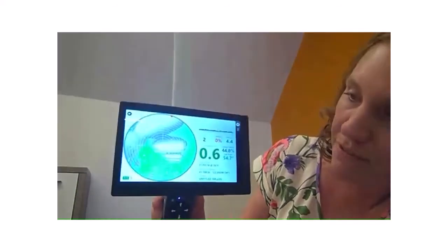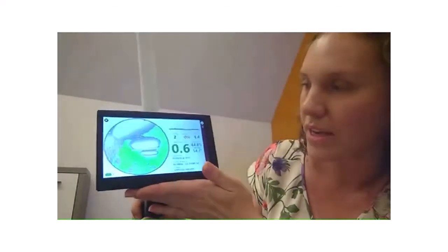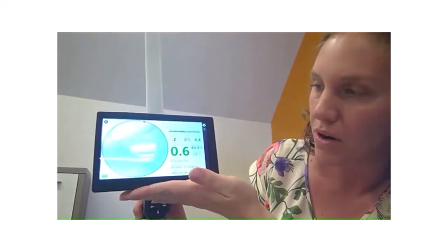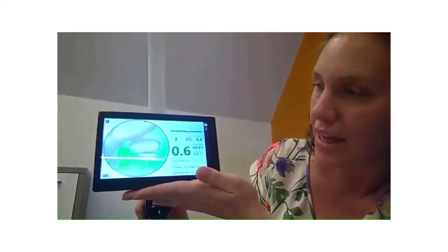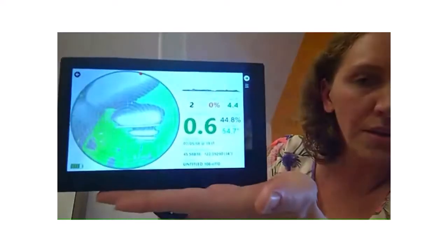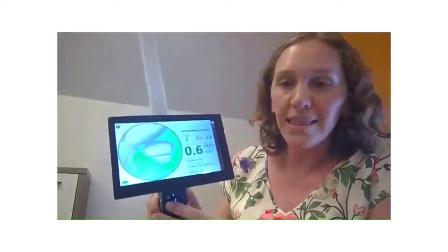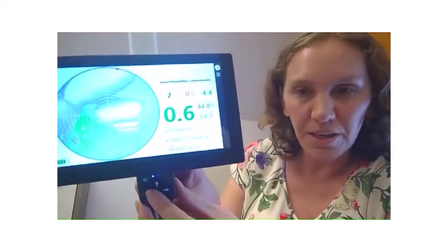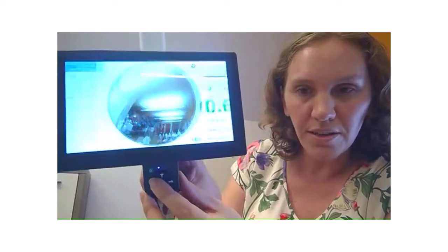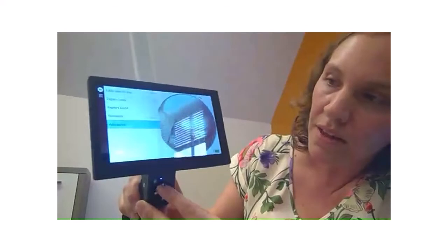And the screen following is going to go ahead and calculate all of those metrics that you want, as discussed before, including the gap fraction, LAI, PAR averages, etc. So taking images is quite simple using this instrument. And again, to get the data off, you simply use the left arrow to navigate back to the main menu.